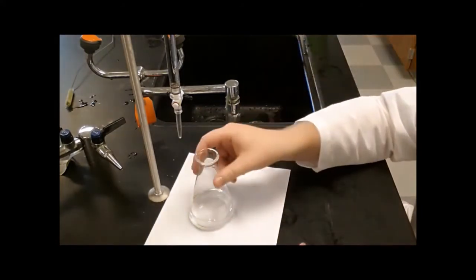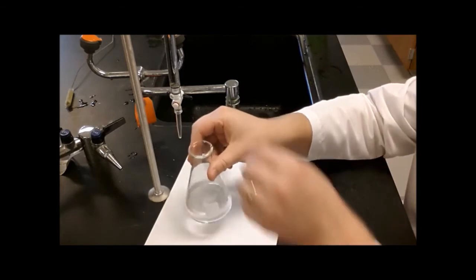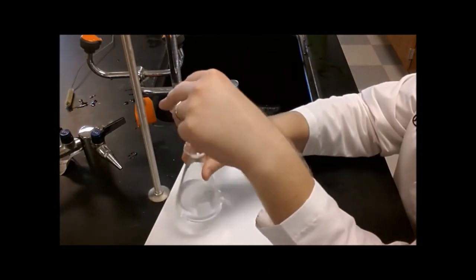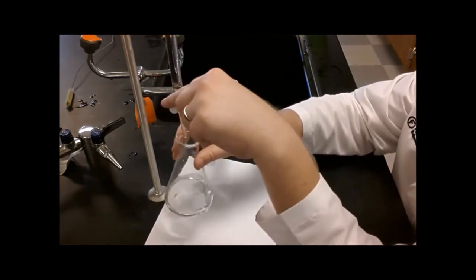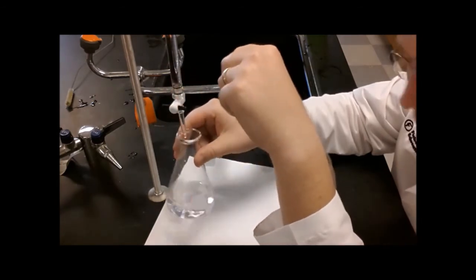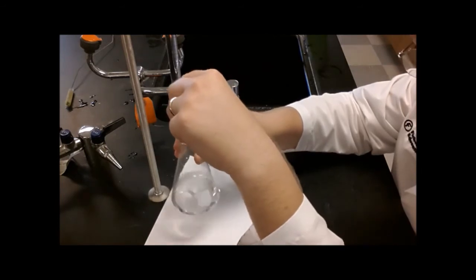Okay. Going to swirl the flask with my main hand and man the stopcock with my other hand. So I'm a righty, so I'm swirling the flask with my right hand and I'm turning the stopcock with my left hand. What I'm going to do at first is open the stopcock and let, oh my goodness, look at that color. I'm going to let the base empty into the flask until I start to see that color.